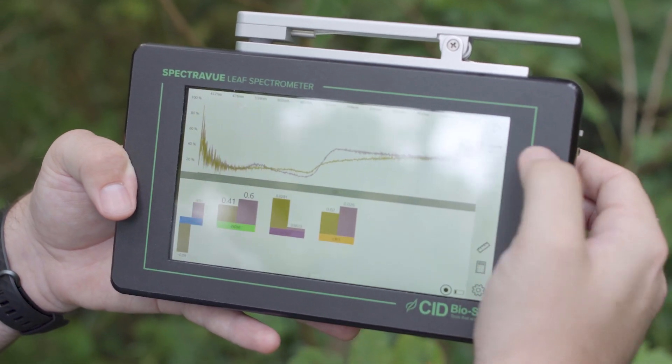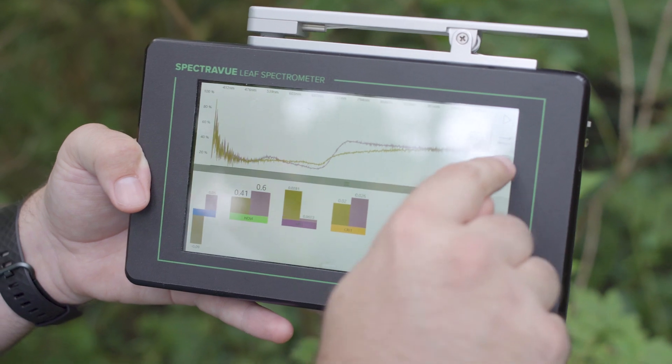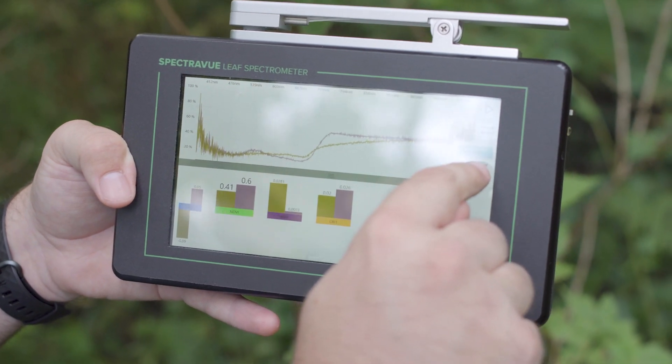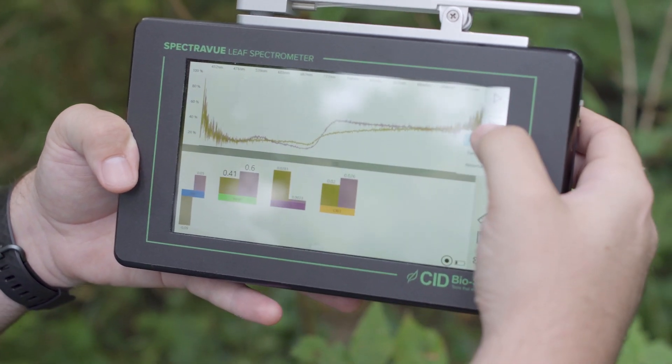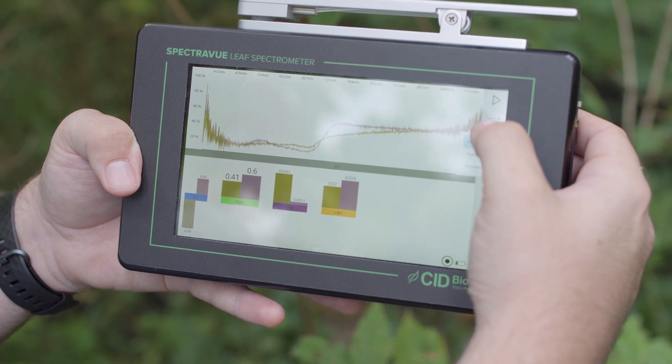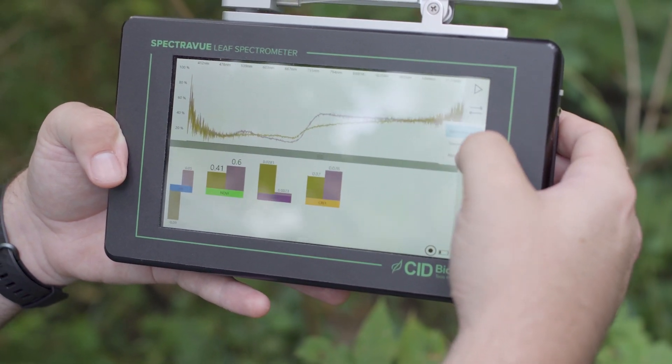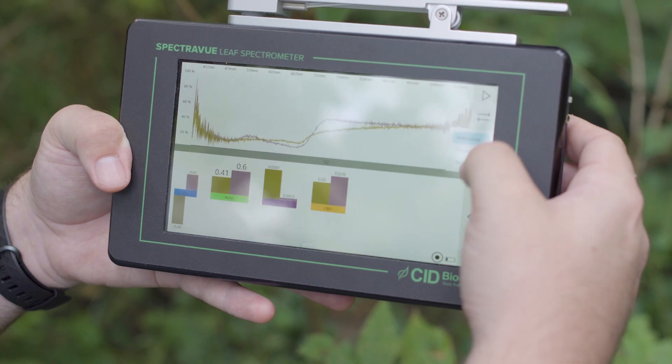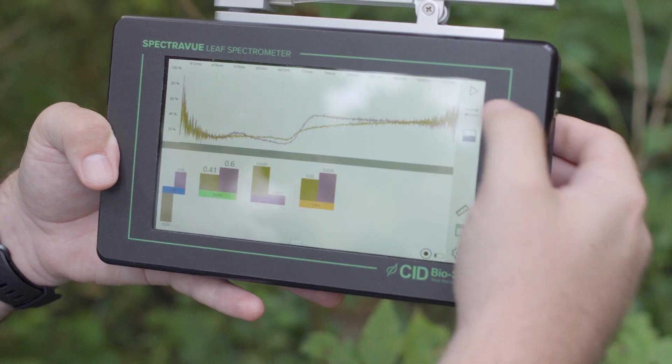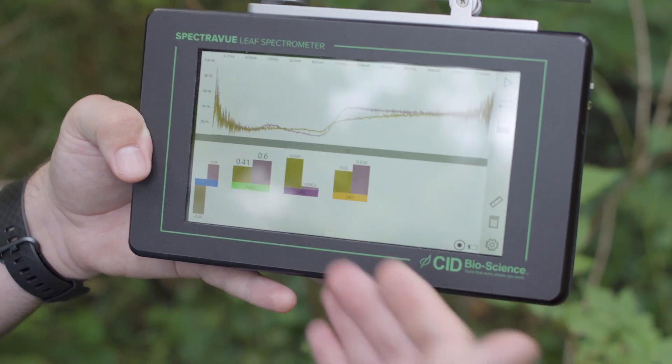Here with the two arrows is where you can change what you're viewing: reflectance, transmittance, or absorbance. So if you're using an index that utilizes a transmittance calculation or an absorbance calculation, you'll want to change this setting prior to getting those calculations down here in this window.